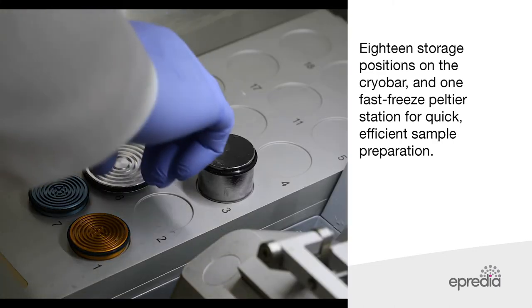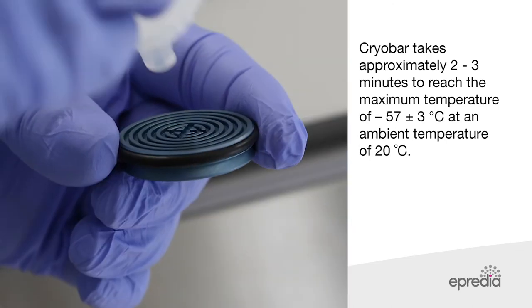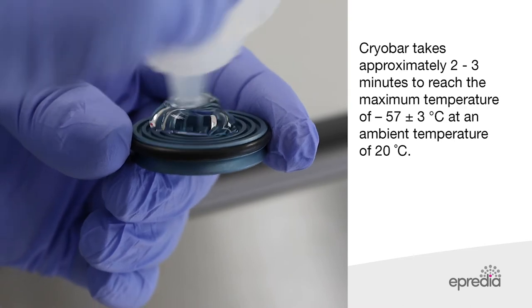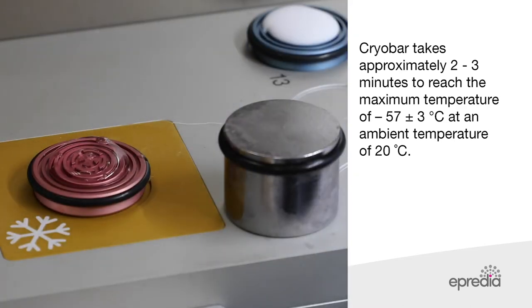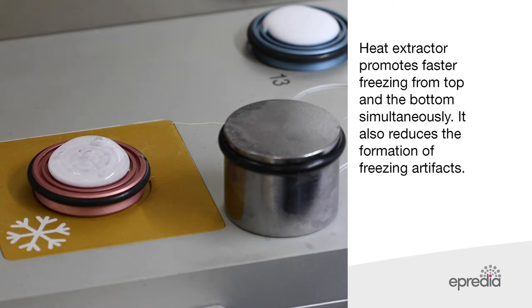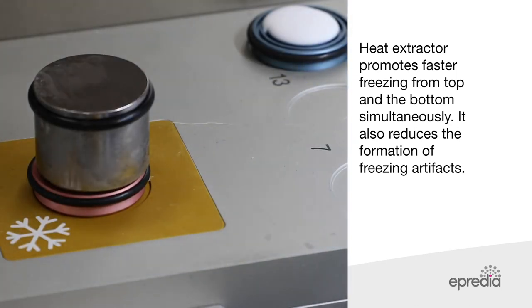The NX50 has 18 storage positions on the cryobar and one fast freeze Peltier station for quick, efficient sample preparation. The fast freeze station is cooled by a Peltier mechanism. When the cryobar is activated, it will take approximately two to three minutes to reach a maximum temperature of minus 57 degrees Celsius at an ambient temperature of 20 degrees Celsius. Use of a heat extractor promotes a faster freezing method which freezes from the top and bottom simultaneously.